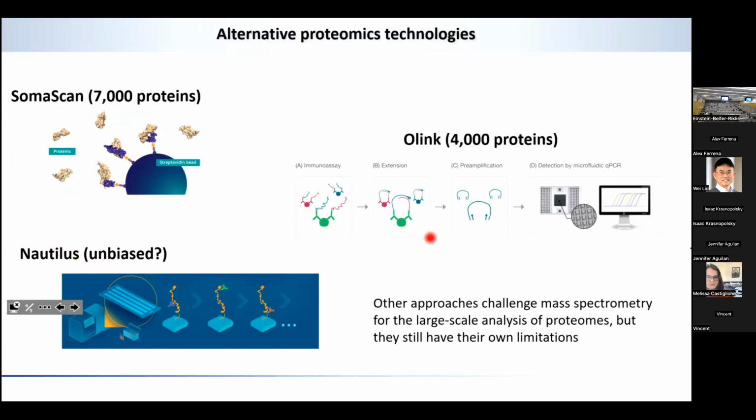Some of them are based on antibodies that are tagged with DNA, and therefore they can multiplex, to study many, many proteins at once. And some of them are based on, again, antibodies, but they recognize very short pieces of proteins, and once they are combined together, they build the protein sequence for you. And the top two are commercially available. They're actually not as rarely used as you might think. The one below is an example of a method that is still a little bit in development.